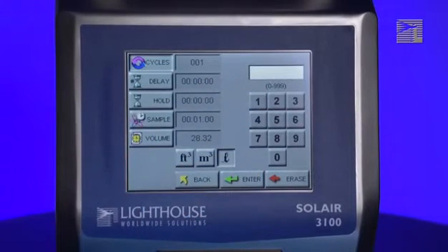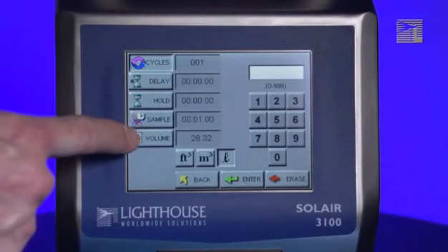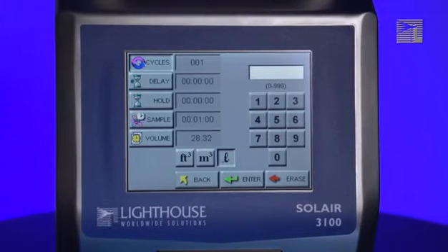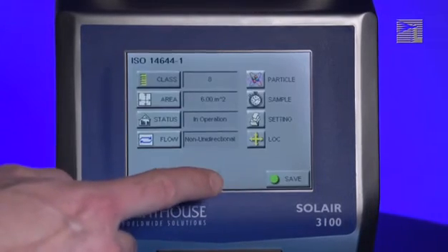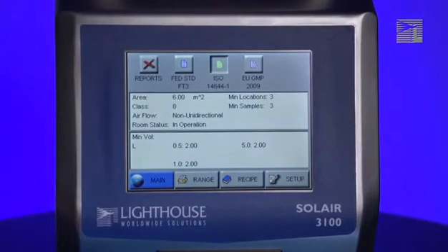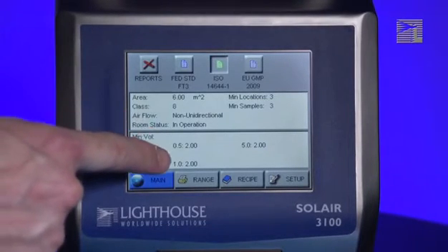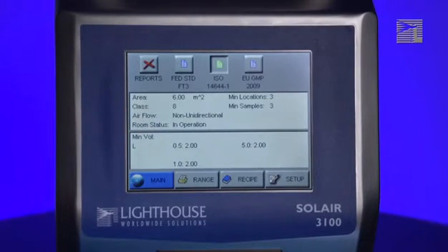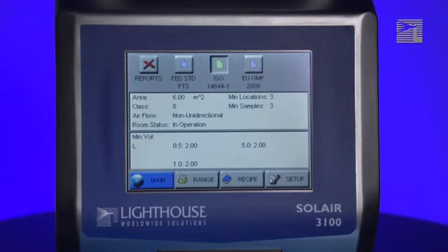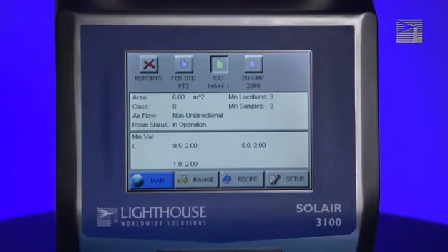Note that you should not change the sample time or the sample volume. Each of the cleanroom standards has specific requirements about the minimum volume of air that must be sampled in each location. These minimum volumes are displayed on the main report screen. As soon as you enable the report, the sample time will automatically be set to the minimum sample time required for the report, based on the particle sizes you have selected to sample. Allowing the particle counter to set the sample time will ensure the data collected meets the requirements of the selected cleanroom standard.